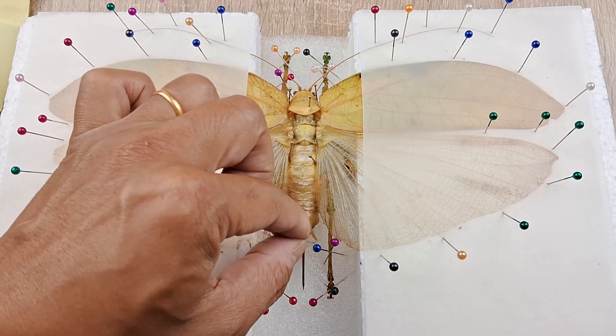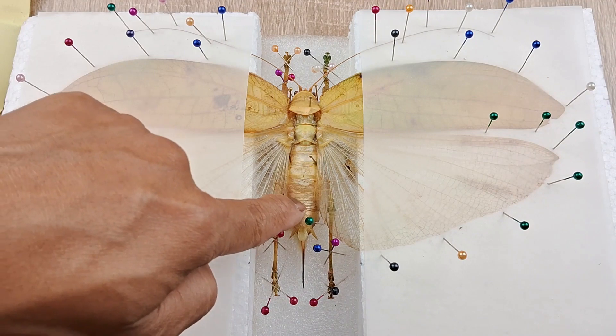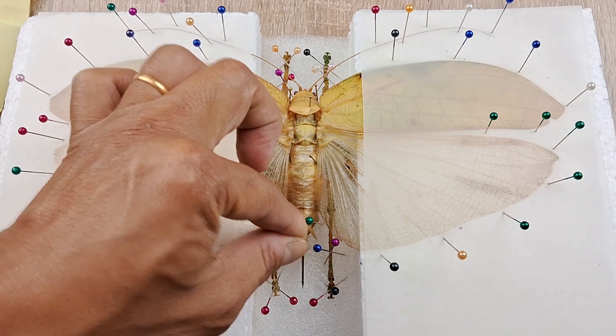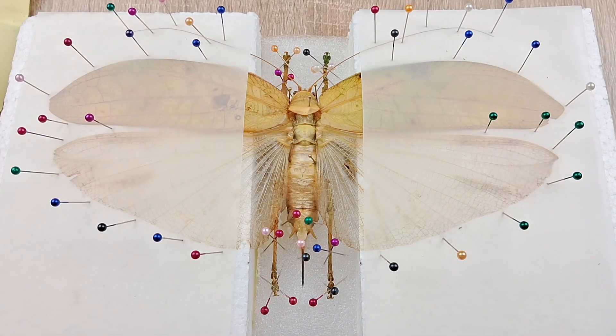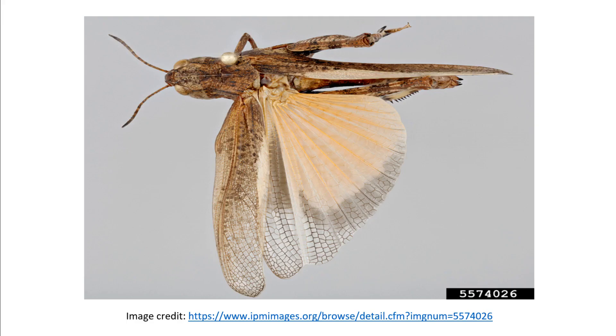Do a final round check of your pinned specimen and use more pins here and there if required to make the specimen look as symmetrical and aesthetically pleasing as possible. I should add here that if the specimen is part of a scientific collection, availability of space in the insect drawers would be more of an issue than aesthetics. So what entomologists would normally do in such cases is that they would spread only one side of the wings, leaving the other pair of wings in its natural position. This allows for saving of space while also not compromising with sufficient unhindered access to the abdominal parts for study.